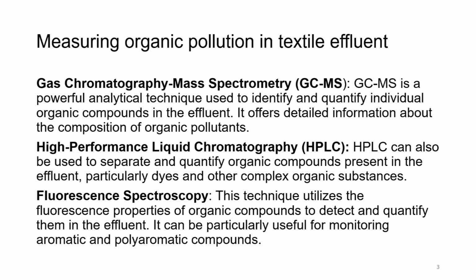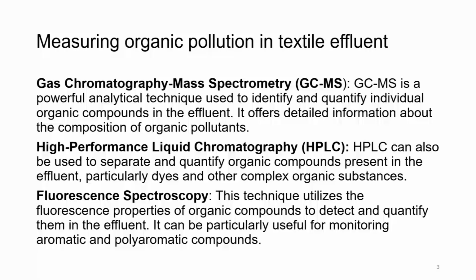This we had not discussed too much in detail. It is a new learning. GCMS is a powerful analytical technique used to identify and quantify individual organic compounds in the effluent. It offers detailed information about the composition of organic pollutants.